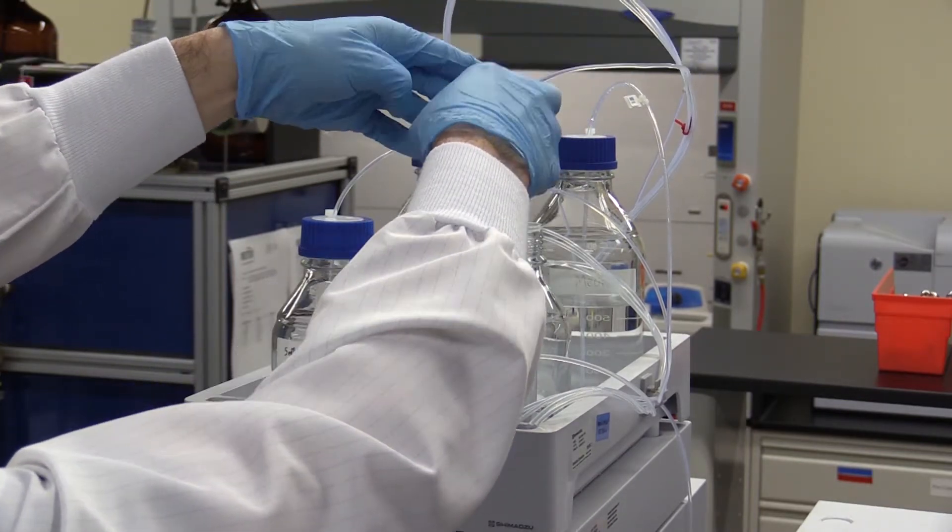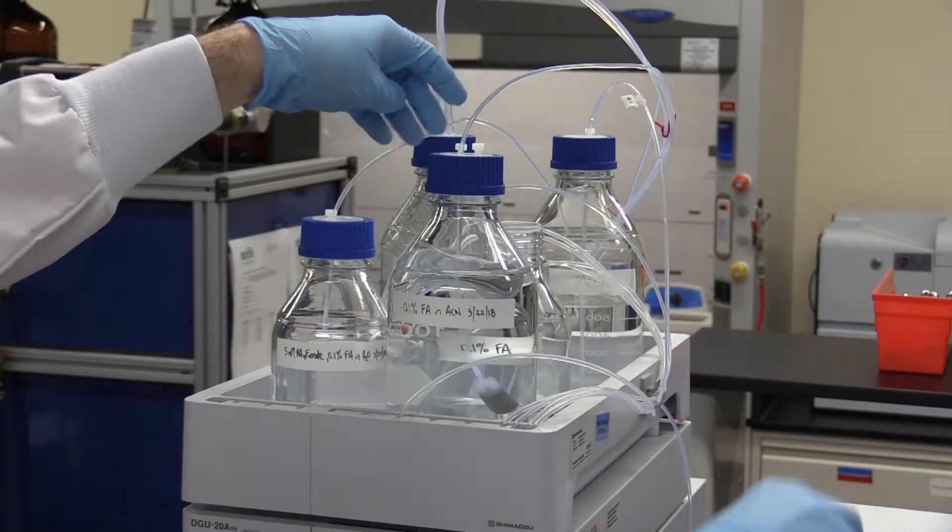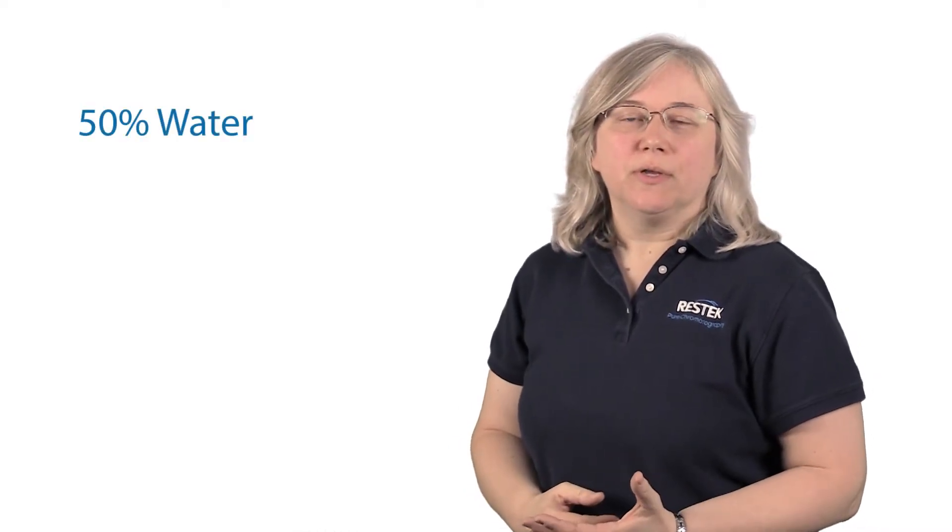And for short term storage, like a couple of days, it's okay to leave this solvent in the column. If you're storing for a longer time, like a week or more, you flush initially as mentioned before and then you prepare a storage solvent with 50% water and 50% organic matching the solvent that you used in your method. Flush for another 10 to 20 column volumes.